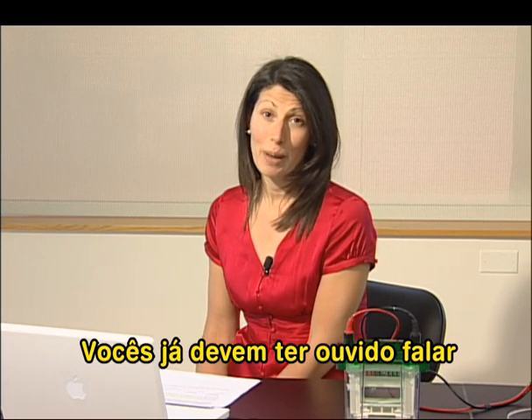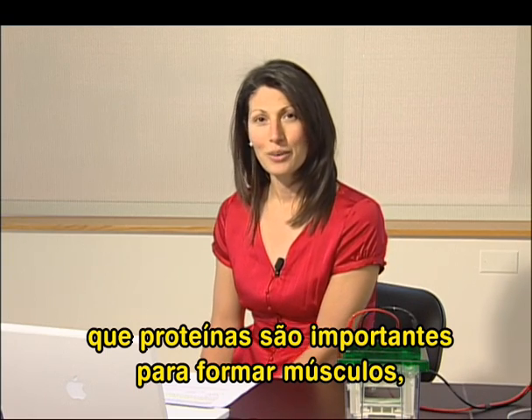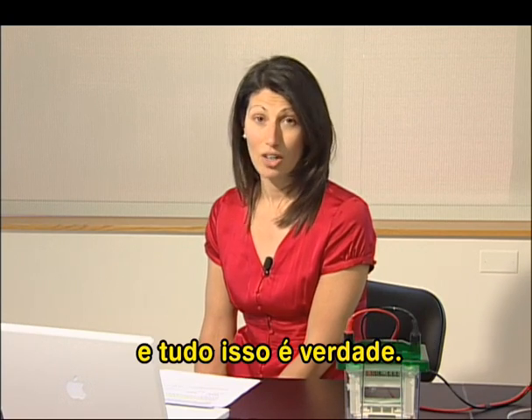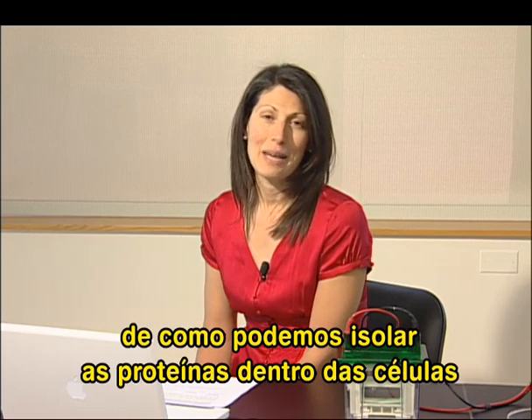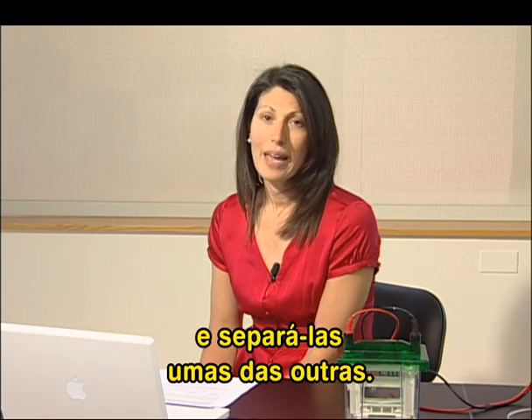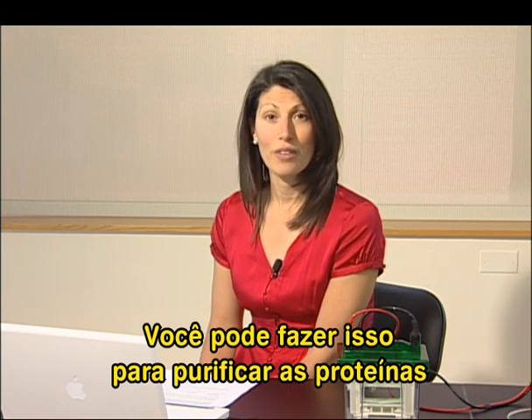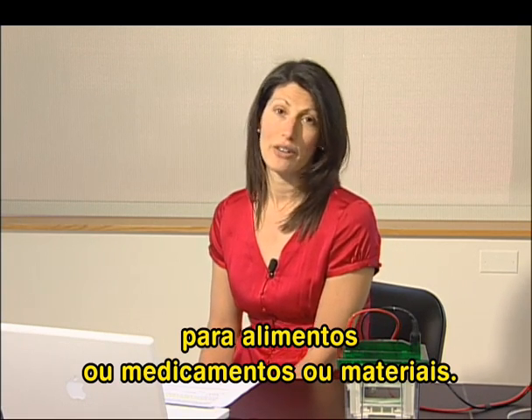Now, you may have heard about proteins as something that's important for building muscles, or something important for living cells, or even something that's built from a building block called amino acids, and all that is true. But today we'll be talking about something else, namely about how you might tweeze apart proteins inside a cell and separate them one from the other. And the reason that you might want to do that is because you might want to purify the proteins for food, or for medicines, or for materials.